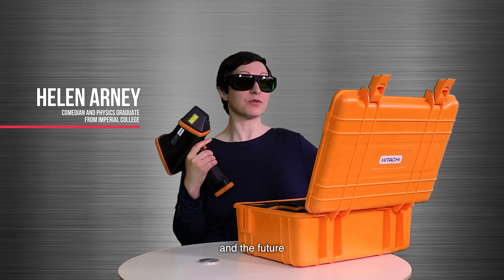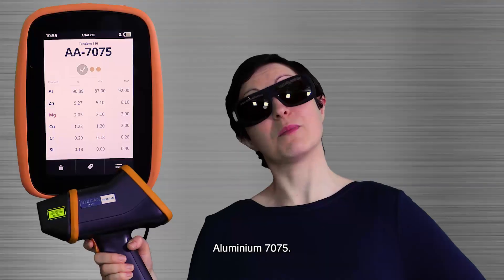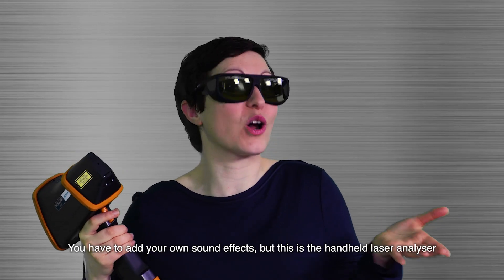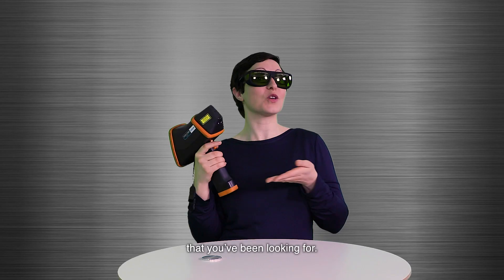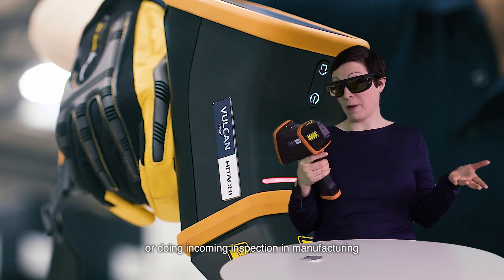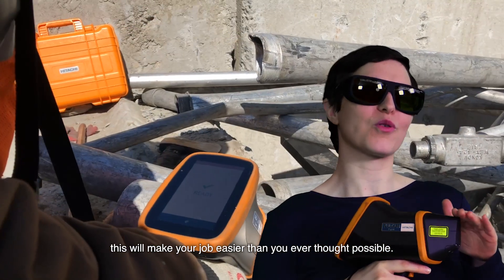I've seen the future and the future is Vulcan. Aluminium 7075 — sweet. You have to add your own sound effects, but this is the handheld laser analyzer that you've been looking for. Whether you're in a scrapyard or doing incoming inspection in manufacturing, this will make your job easier than you ever thought possible.